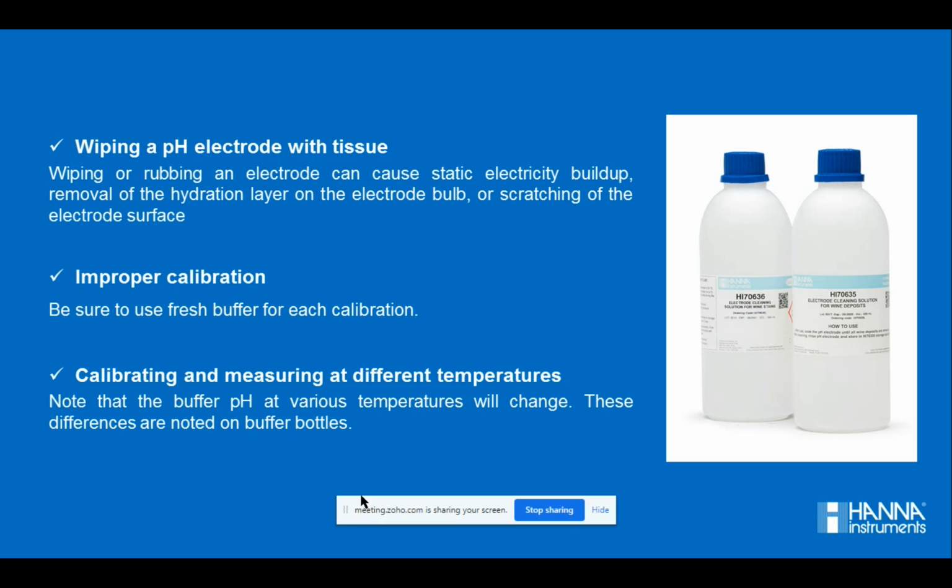So, if calibrated properly, the millivolts generated can be related properly to the calibration graph and thus will give a proper reading, approximately proper reading. Thus, improper calibration can lead to highly inaccurate readings.